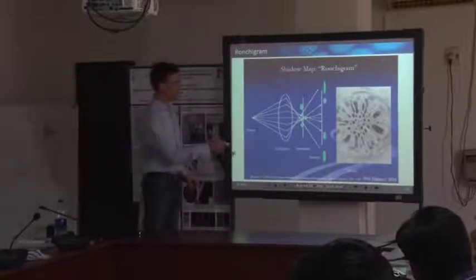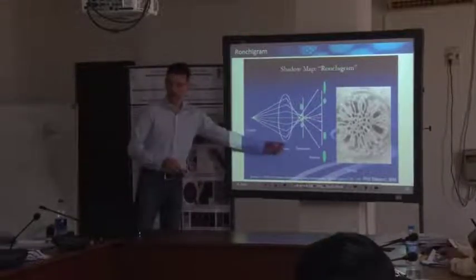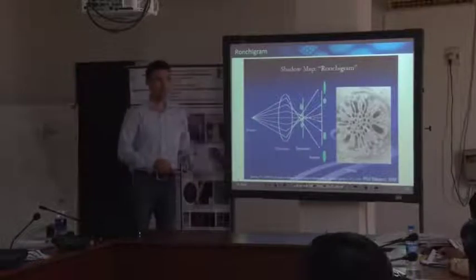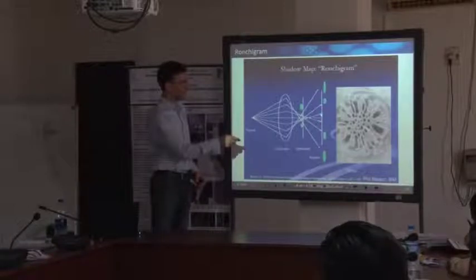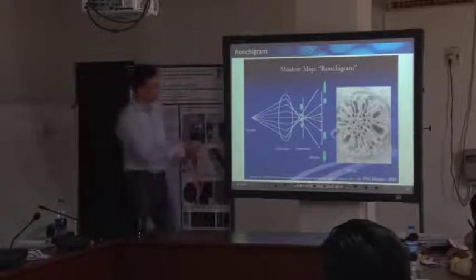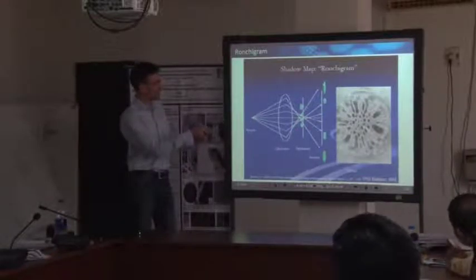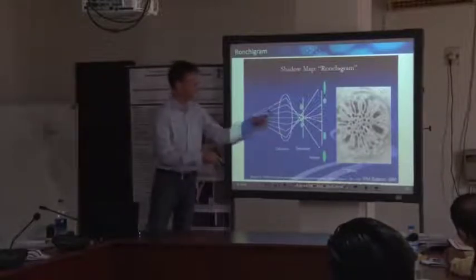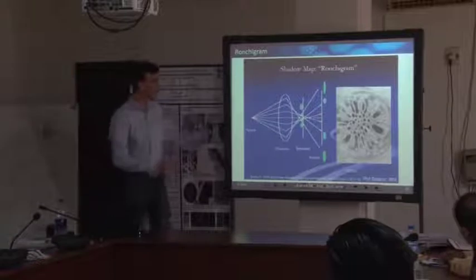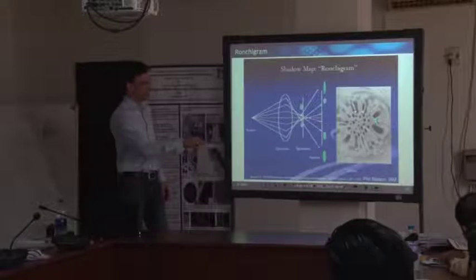So the image here on the screen, if you slightly under focus our probe, meaning that the strength of the lens is low, then you end up with an inversion here. But in these outer regions, just follow these rays, they just propagate into our back focal plane. For these outer rays, the image is not inverted, in this particular case, for an underfocused probe. So the inner part of our shadow image is inverted, while the outer regions are not inverted.